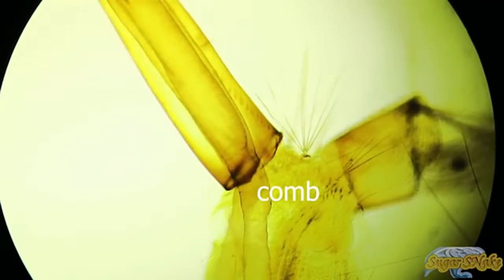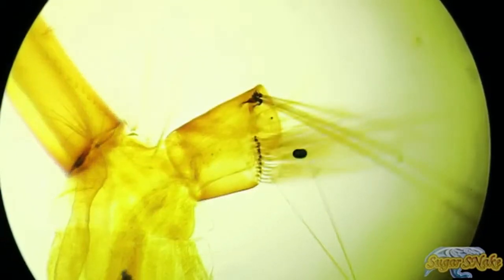Larvae develop through 4 stages, or instars, after which they metamorphose into pupae. At the end of each instar, the larvae molt, shedding their skins to allow for further growth.